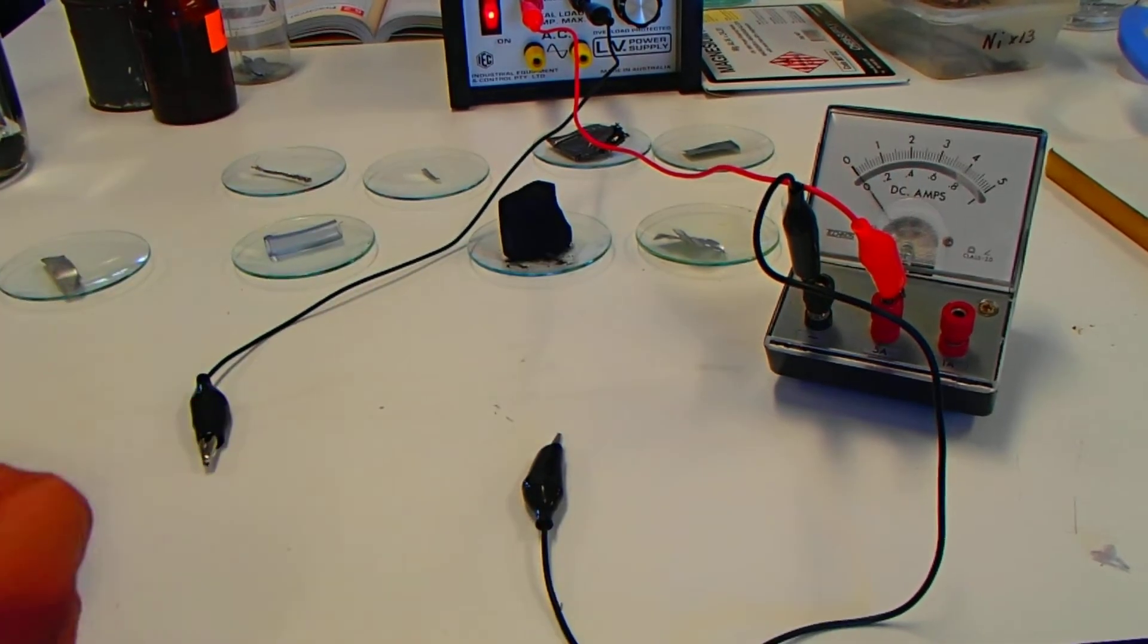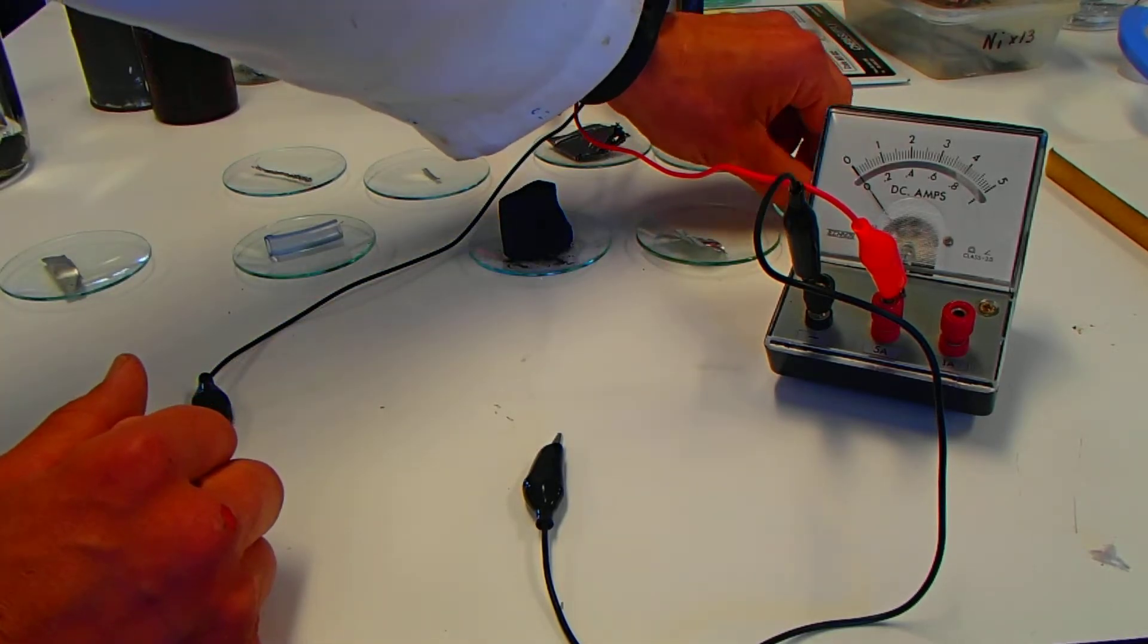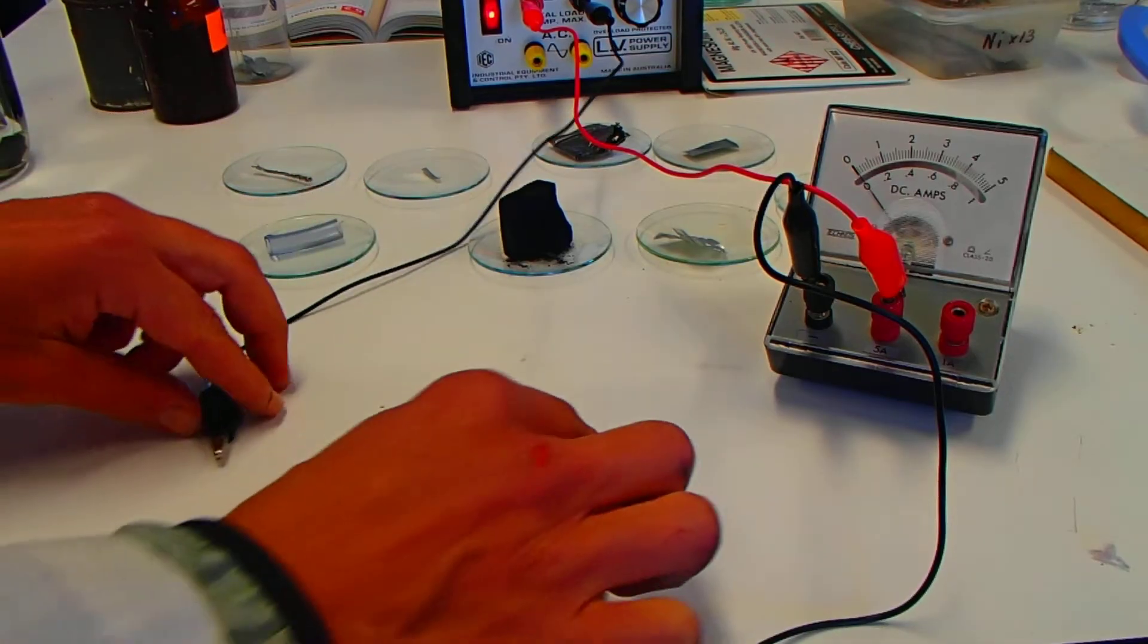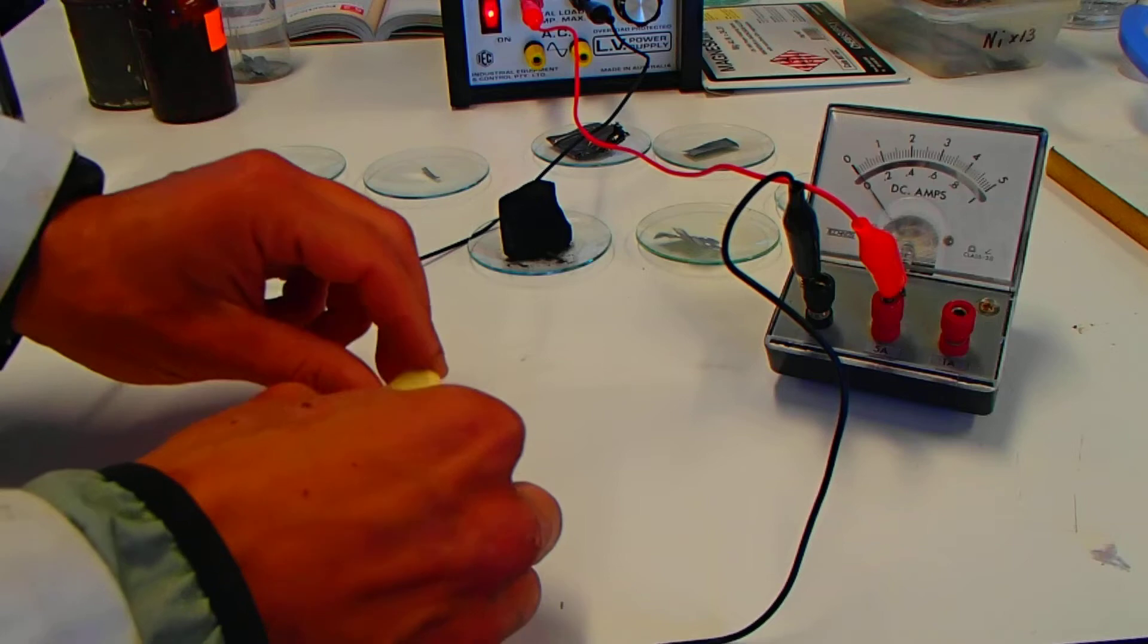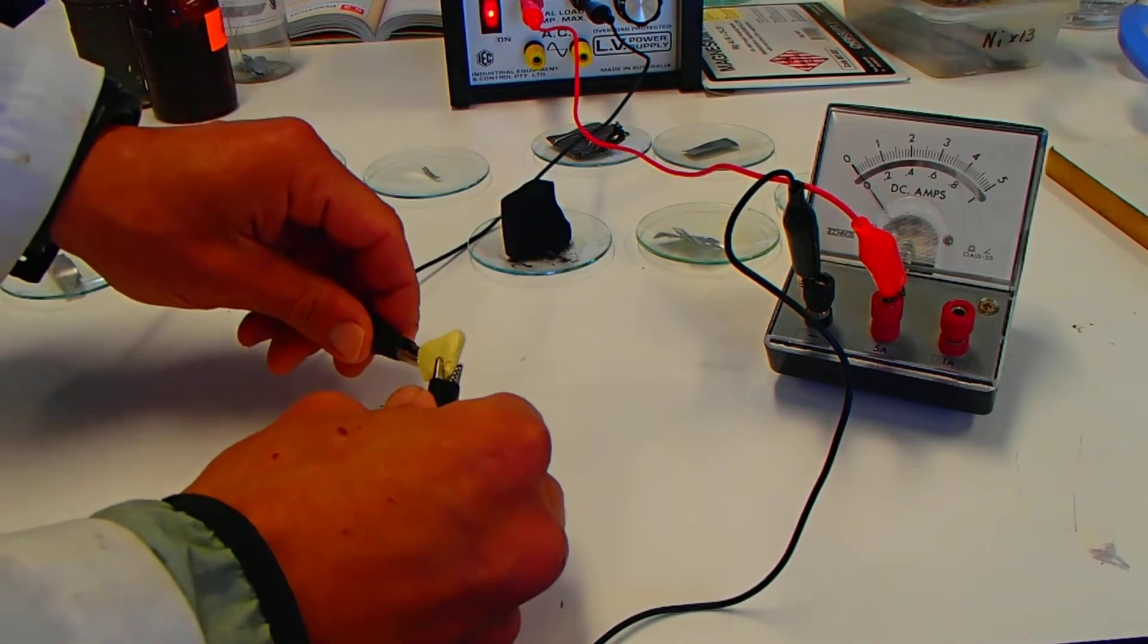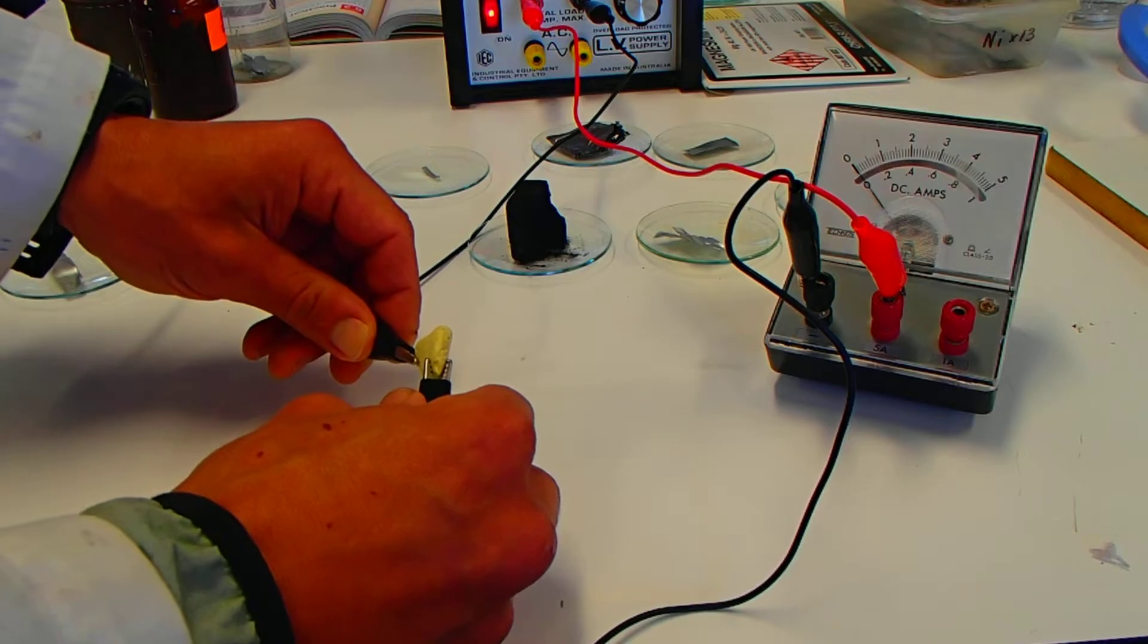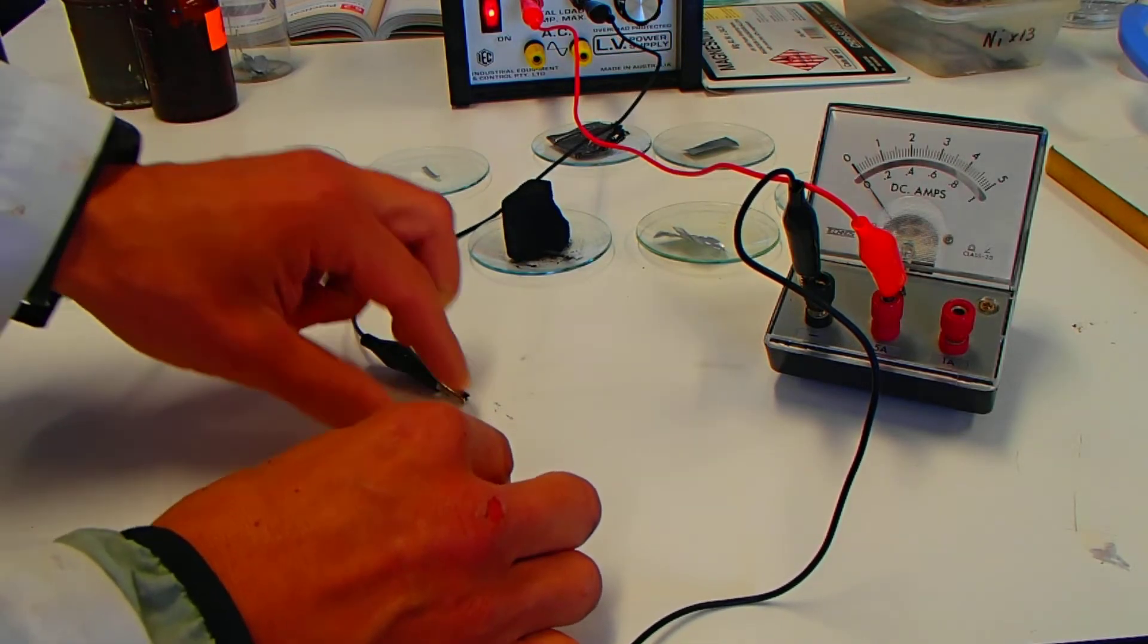Now again, we're going to be testing our nine samples that we have here today. So first of all is our sulfur. Let's see if the sulfur has any current passing through it. I'm going to touch it on there. No, I might even clip some on just to get a definite clip there. And no, nothing going through there at all. So again, that might suggest something about the nature of sulfur.